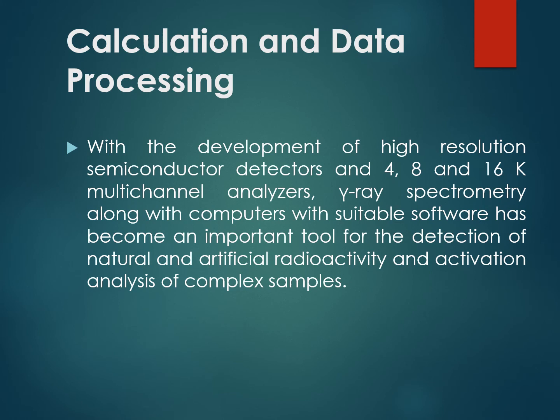And with the development of high resolution semiconductor detectors and 4, 8, and 16 K multi channel analyzers, gamma ray spectrometry, along with computers with suitable software, has become an important tool for the detection of natural and artificial radioactivity and activation analysis of complex samples.